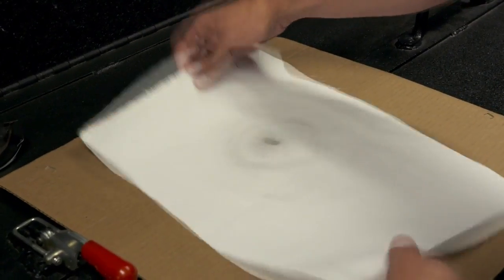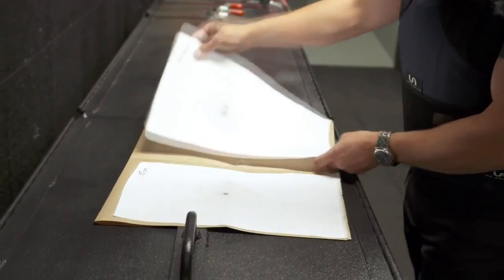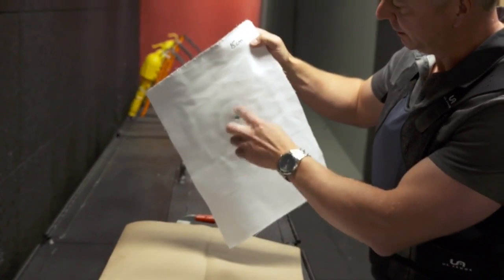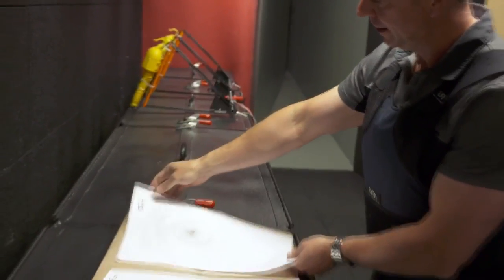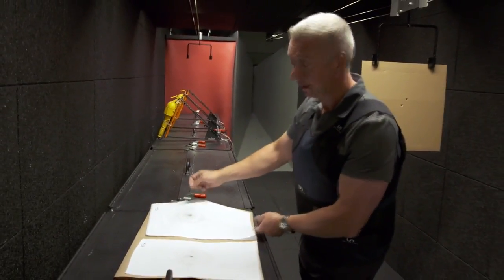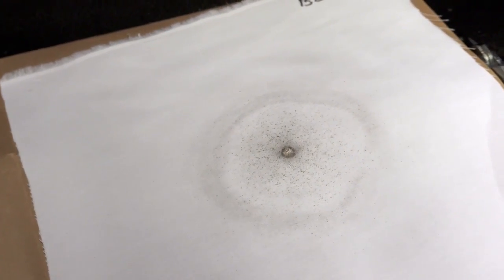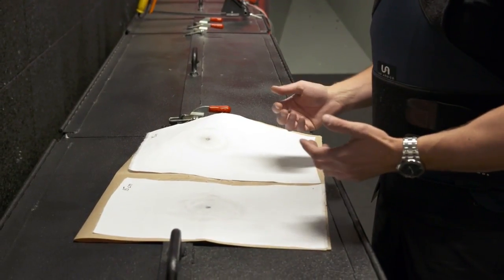In handguns, short barrel firearms, not all of the gunpowder has a chance to burn before it exits the barrel. So what you're seeing as little specks here is partially burned gunpowder. There's also some residues on here that are invisible to the naked eye as well. So we have chemical methods that we use to visualize this.